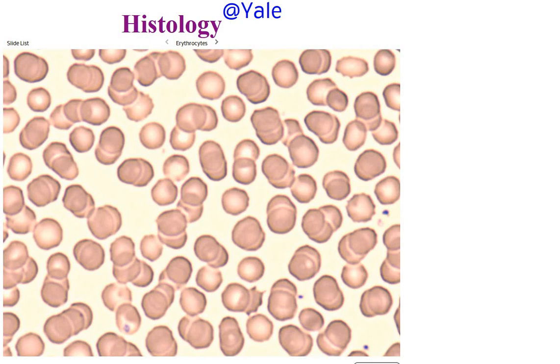Lab 20 is blood histology. So from the name, we know there will be no models associated with this lab. And in this video, we're going to cover all of the histology you need to know on a microscope slide.